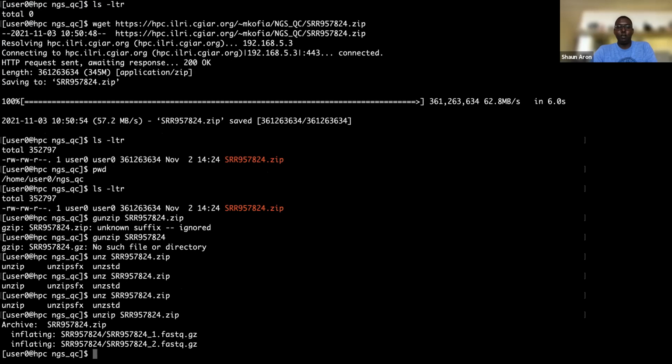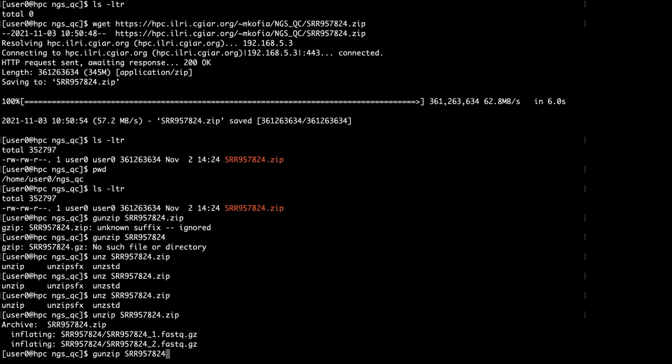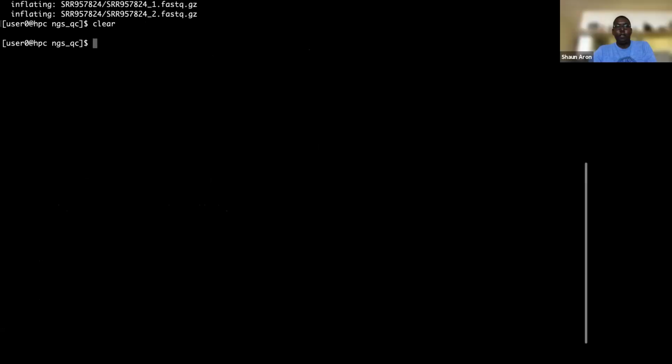Okay, so sorry for that typo. So it should be unzip.